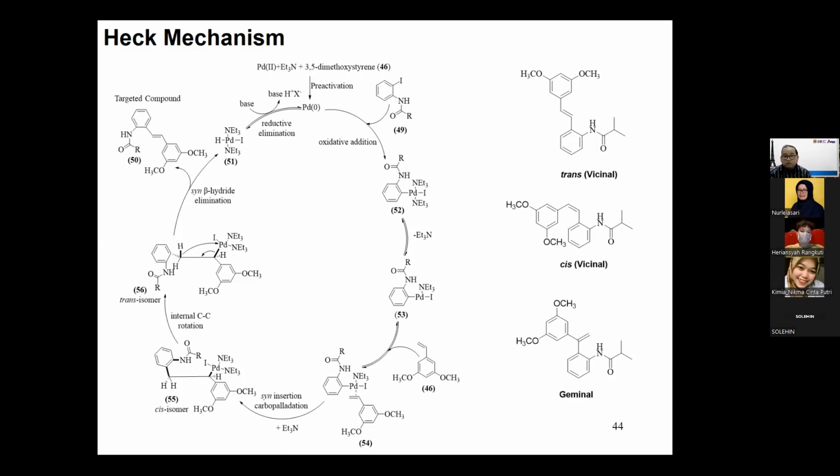Because from here you can see the different patterns of the coupling. So for example, you can see this proton coupling with these protons, but the J coupling value is typically around 16 hertz. Meanwhile, for the vicinals, you can see 9 to 10 hertz, but for the geminals, you can see the different patterns of the NMR. Because of the coupling, you can see two types of doublets.